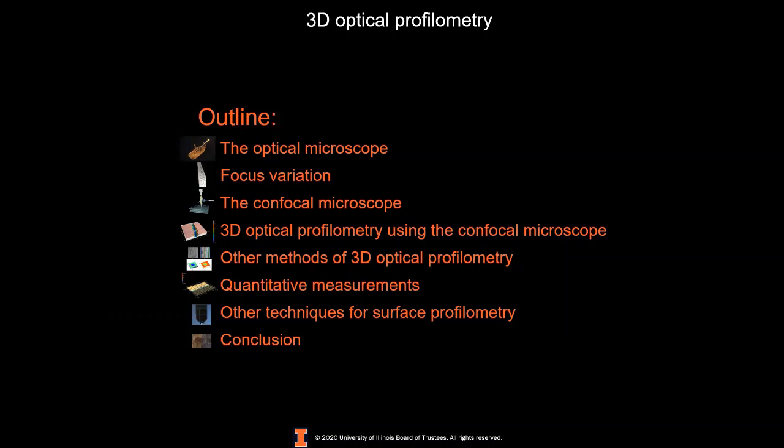Today we'll give you an introduction to the basics of three-dimensional optical profilometry with an emphasis on focus variation and confocal microscopy. I'll start by talking a little bit about the concept behind an optical microscope, then introduce the focus variation method for surface profilometry.